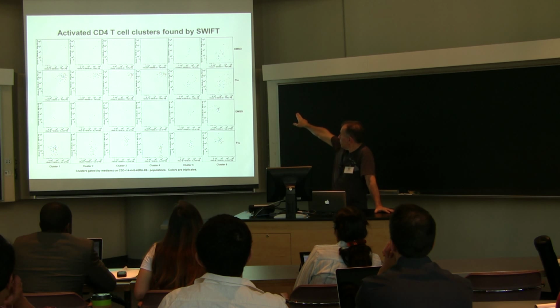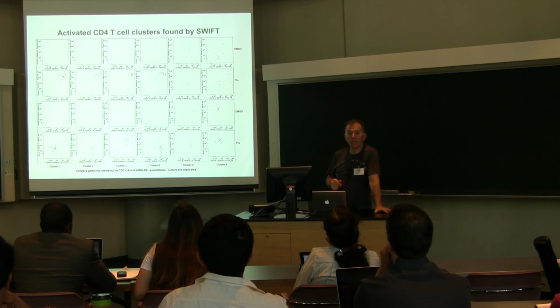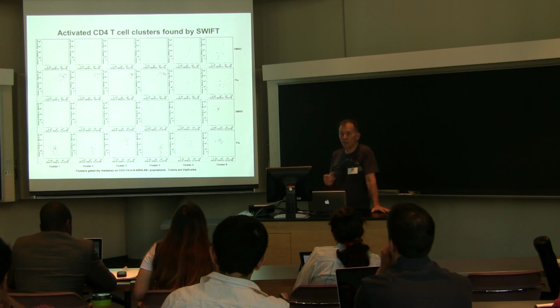But if you look at the influenza-stimulated ones, now you can see that there are a lot of cells, and those first 4 clusters all seem to be making TNF and interferon gamma. So we've got a very nice signal-to-noise ratio. It's successfully pulled out these clusters. And remember, this clustering was done with the joint sample with everything mixed together. The 3 colors represent the 3 replicates, and they're pretty well evenly replicated. So you may wonder why we have 4 apparently very similar clusters making the same things, and they've come through the gating procedure as well.